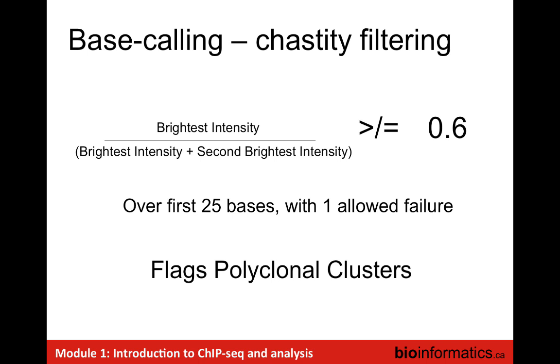Are you guys familiar with this? This is something that's encoded within the FASTQ file, right? Does anybody know what this is? Anybody heard of this before? Okay, so chastity is a way of flagging polyclonal clusters, okay?